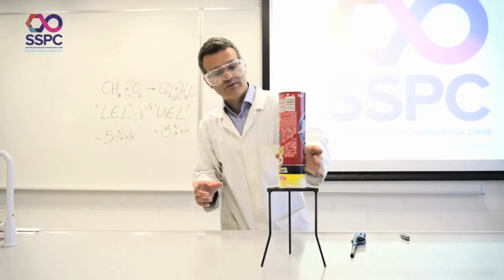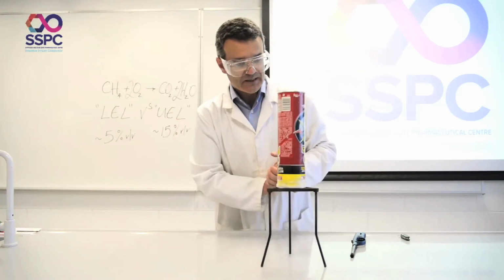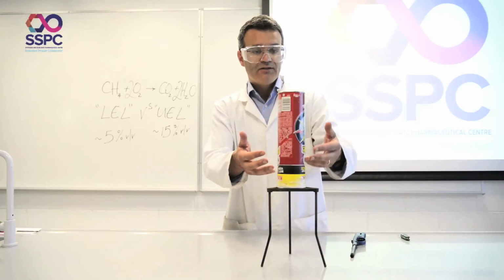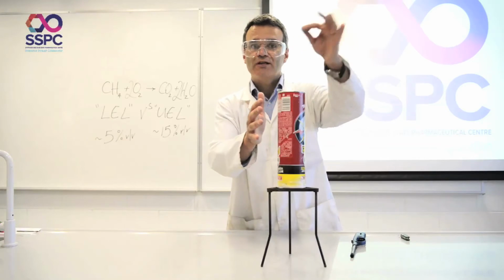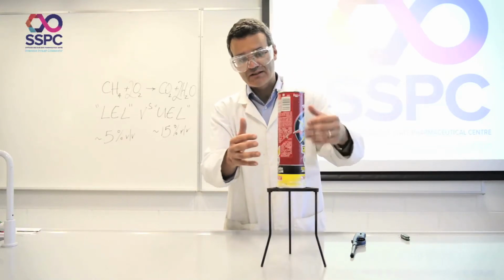We'll start with 100% methane and 0% air. As you burn it, air is going in the bottom, and you're getting less and less methane. So you start with 100% methane in here. As it's burning and burning and burning, you go from 100 down to 90, down to 80, 70, 60.